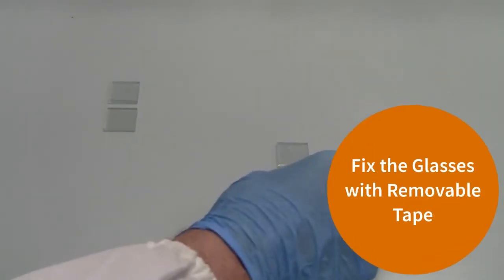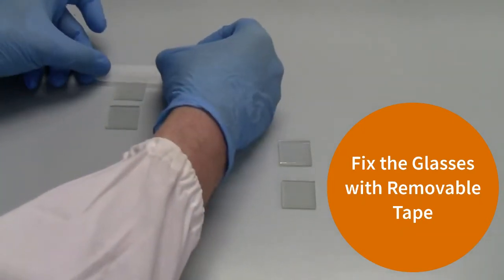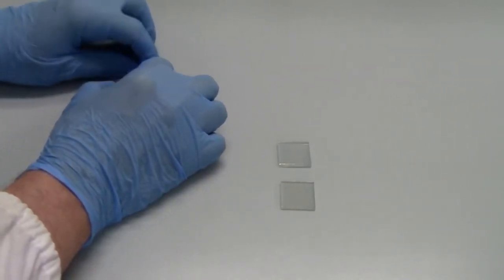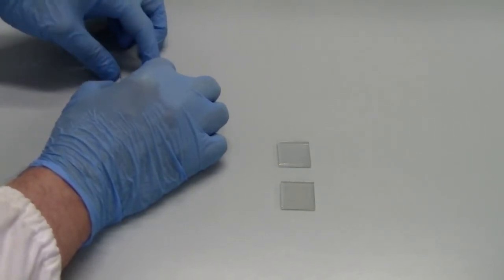Now we will fix the glasses on the bench. We will use a removable tape in order to cover the first 3 to 5 millimeters of the first upper glass. After, we will join the two glass pieces and we will join them also with the two pieces of tape for about 2 millimeters wide contact.